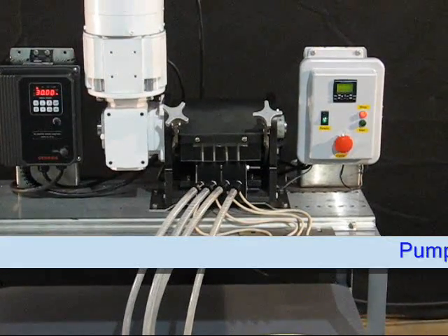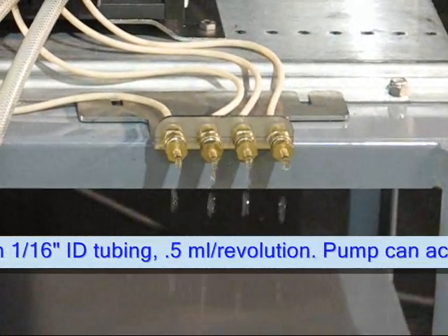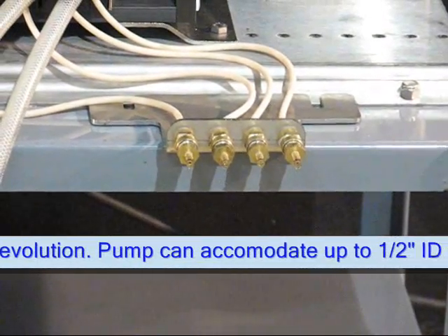Here we have a four-channel discrete manifold Accustaltic pump set up to run a very small dose of four-tenths of a milliliter.